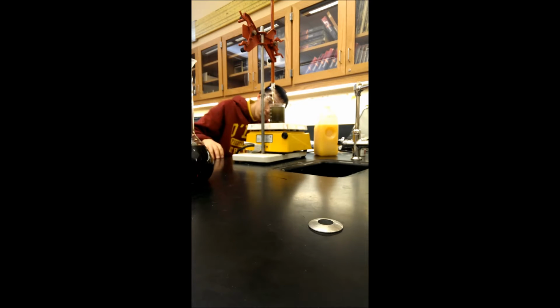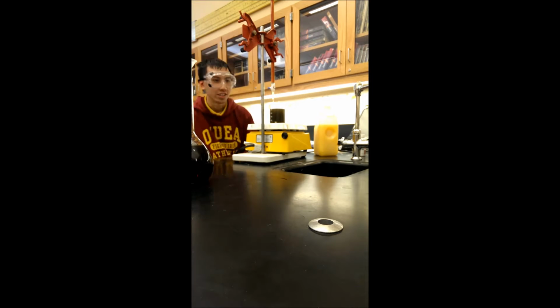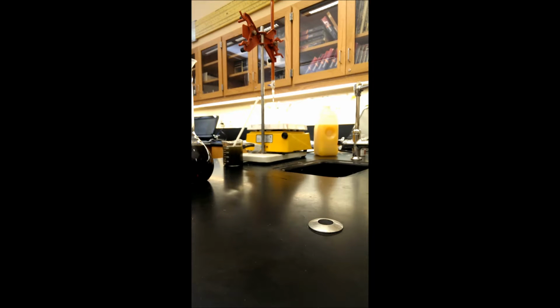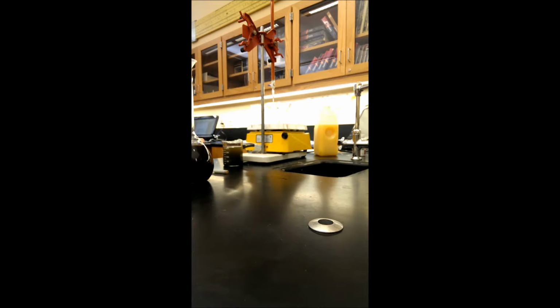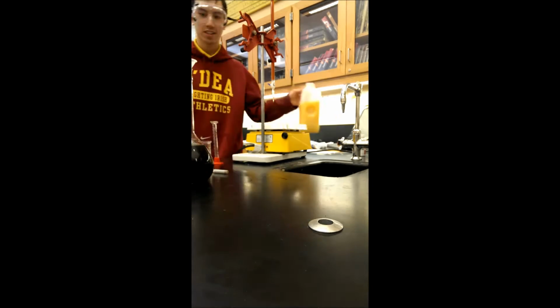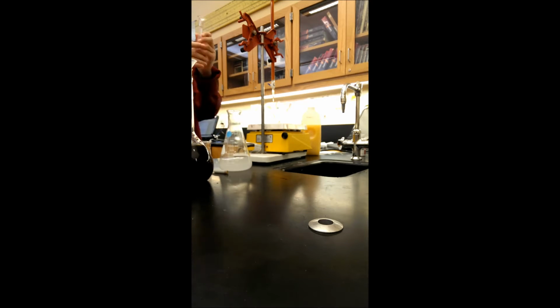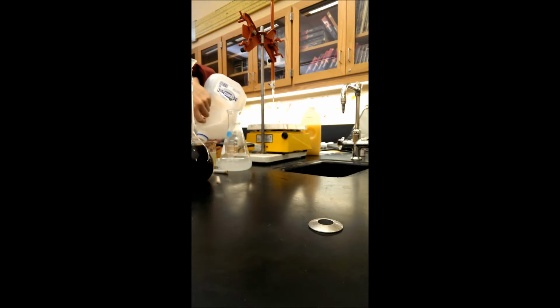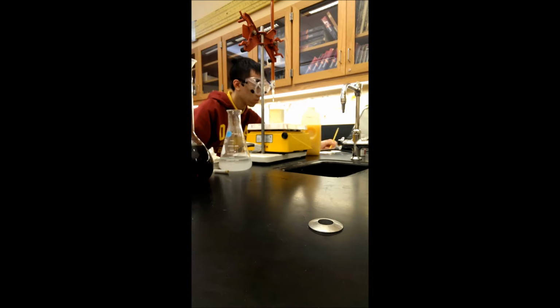And so there you can see the color change is pretty drastic. It turns pretty dark because when the iodine reacts with starch, it creates a really dark color. So based on that part of the experiment, it took about 4 milliliters of iodine solution to have the reaction reach its endpoint, or titration reach its endpoint.